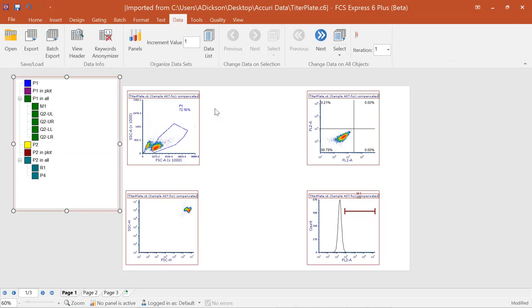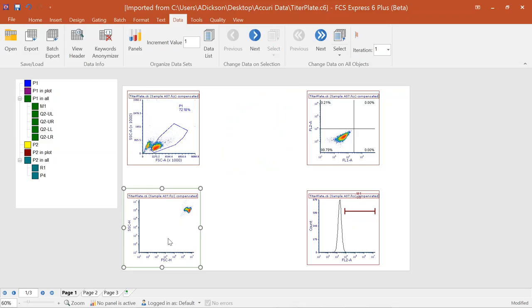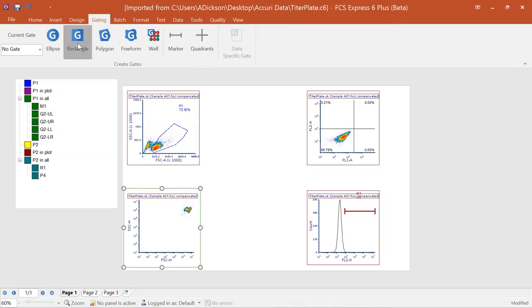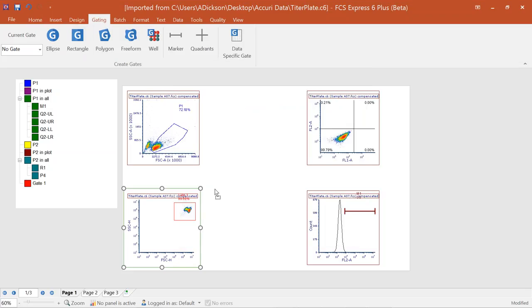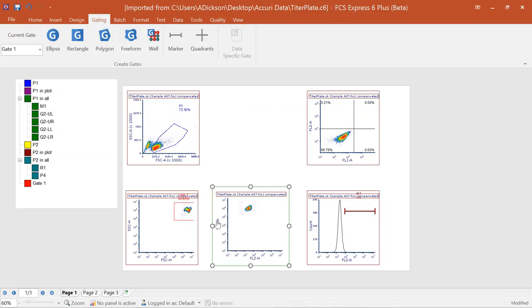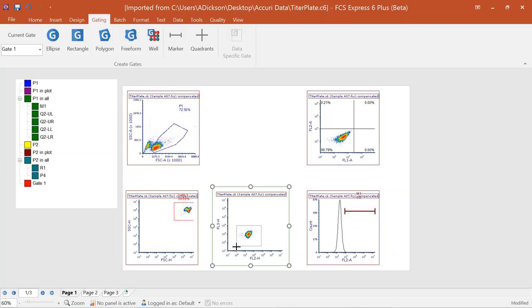Close the data list, and you can click and drag to add new data plots and change parameters as needed. A particularly useful tool is the magnifying resolution feature. With the Accurie's seven-decade data displayed in its native 24-bit resolution, you can click Magnify Resolution, click and drag across a region to zoom in, and examine your population in more refined detail — limiting the view to just the decades of data you need instead of all seven.